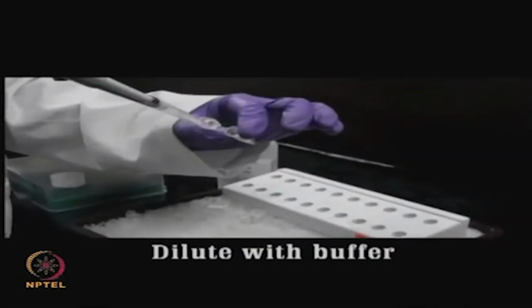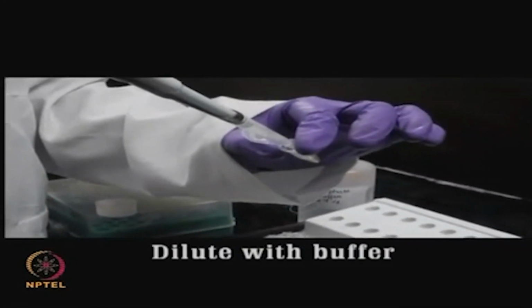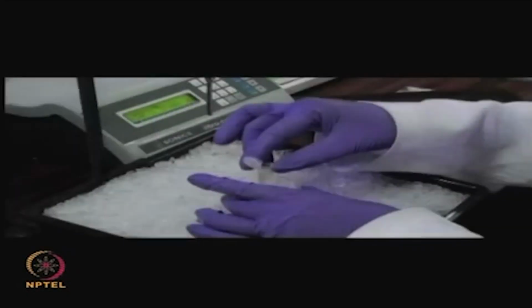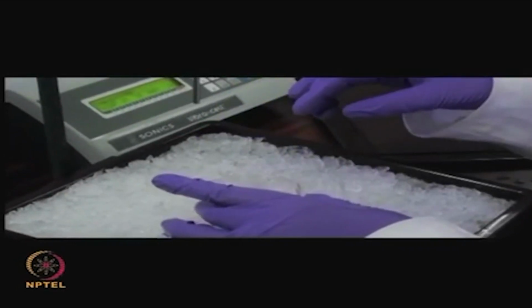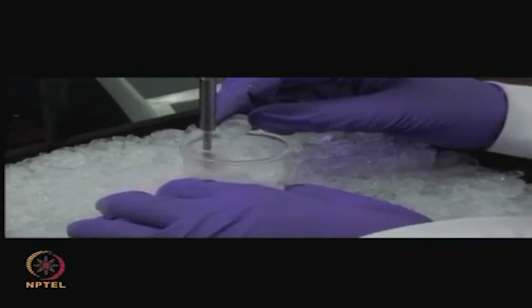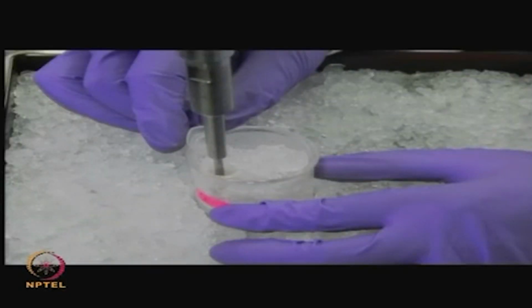Dilute the serum sample 5 times with phosphate buffer of pH 7.4. Vortex the sample to allow complete and uniform mixing. Place the tube on ice and sonicate the serum by providing 6 cycles of 5-second pulses at 20% amplitude with a 59-second gap in between each cycle.